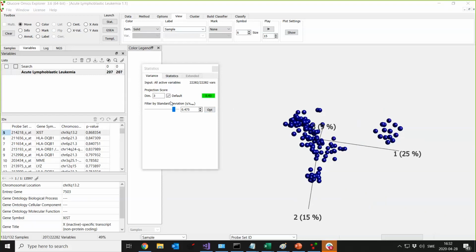It can be very noisy due to experimental conditions, due to the type of data you're measuring, due to equipment. It can be all sorts of things. So I can't give you guidelines on if 0.2 is enough for your data, unfortunately.